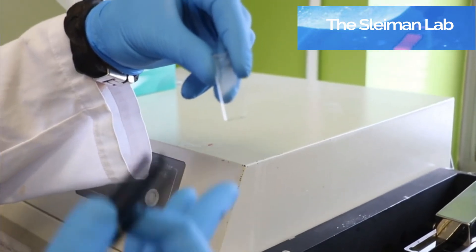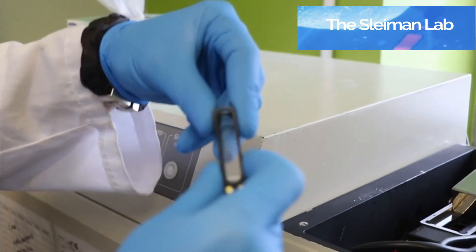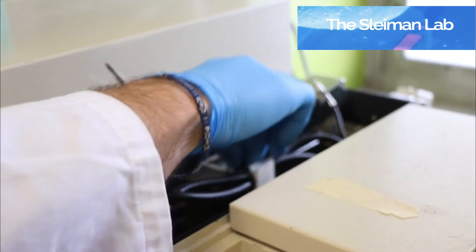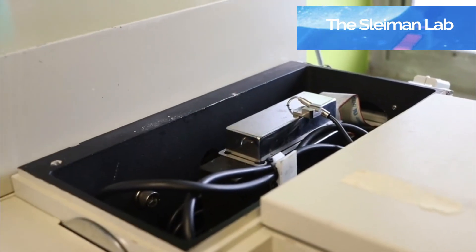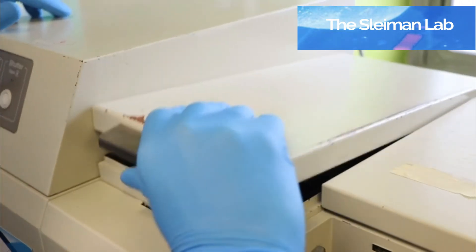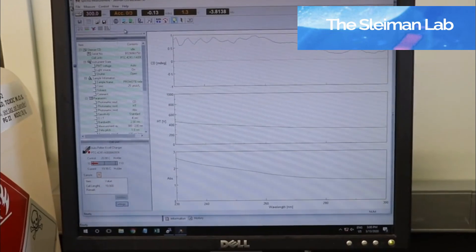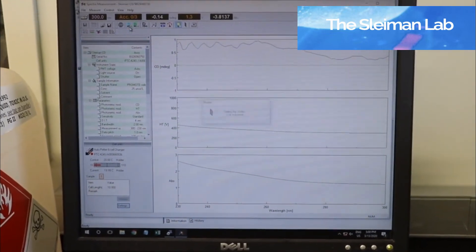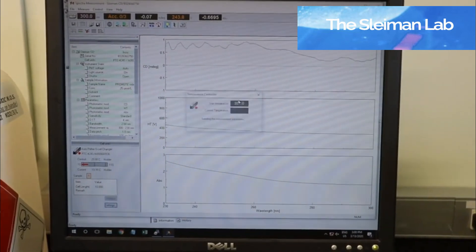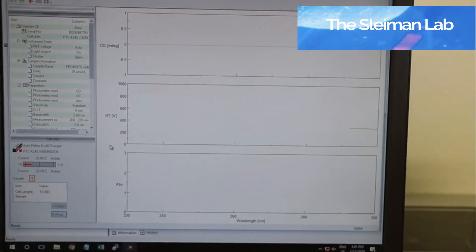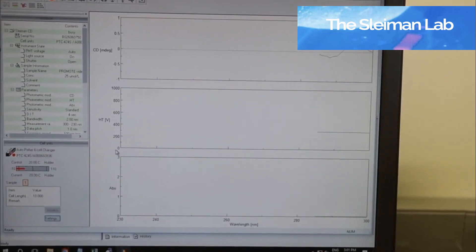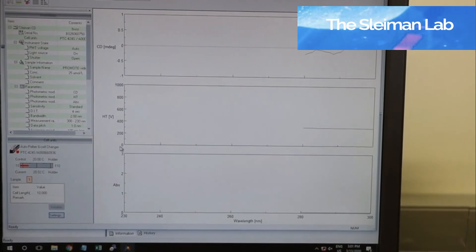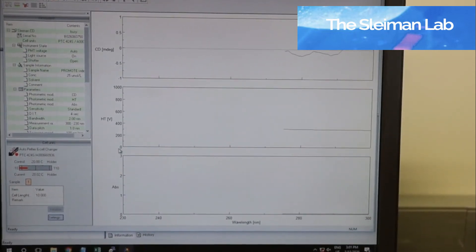So we've used the same technique, and now we've put in our sample. Now we want to click on S for sample. Cell 1 is what we've decided we put it in. So circular dichroism is going to measure the difference in absorbance by the right polarized light and left polarized light.